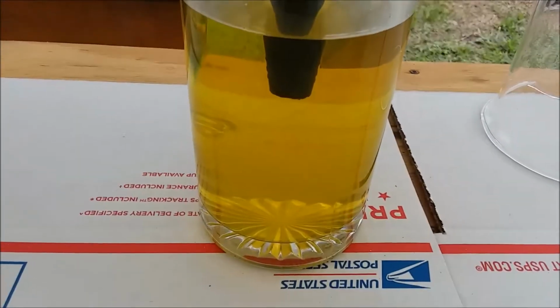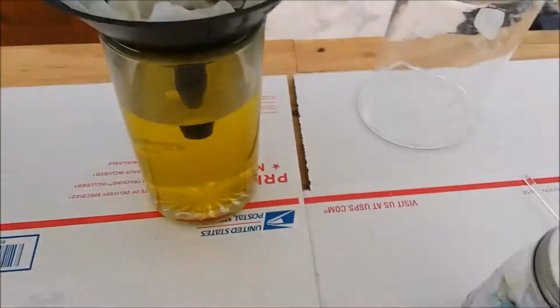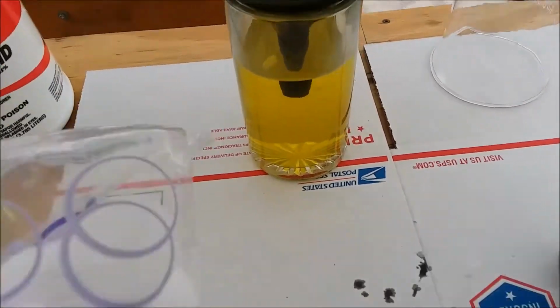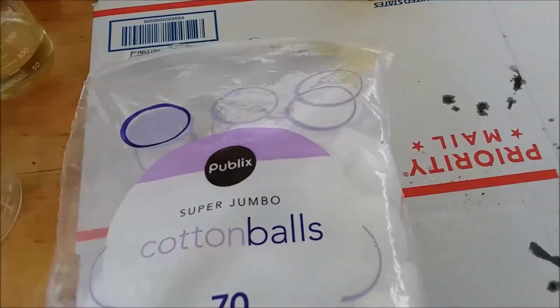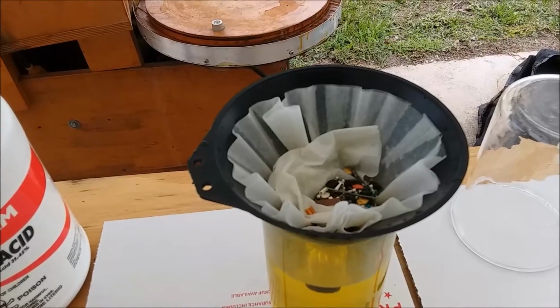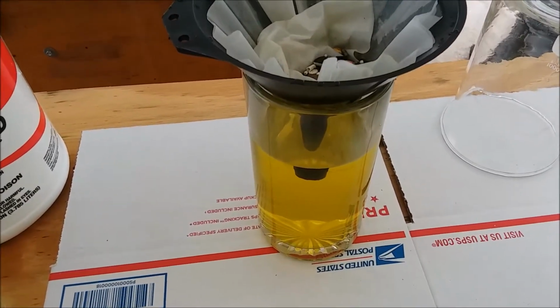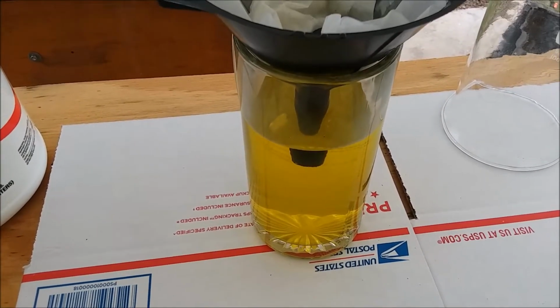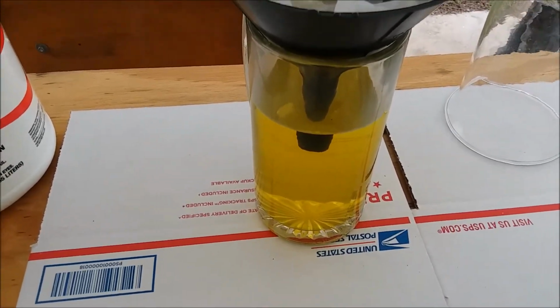So I think what I'm going to do is filter it again. I'm going to take these filters out, put them in my gold filter jar, and I got some cotton balls here. I'm going to stuff the neck of the funnel with some cotton balls for extra filtration, and put another couple layers of coffee filters in there and refilter this solution again, just to see if I can get it to clear up a little bit, because it is kind of cloudy. So I'd like to get as much of the debris out of it as I can before I precipitate the gold.